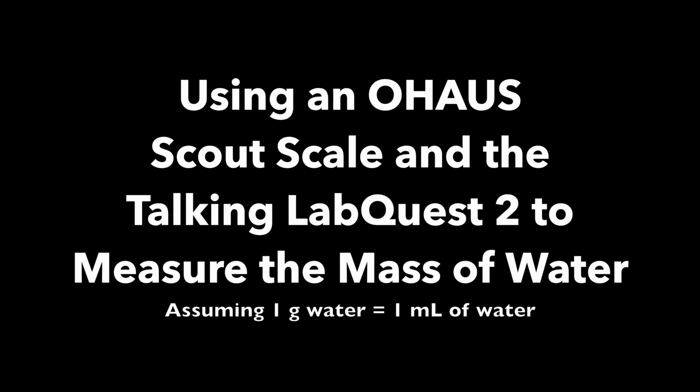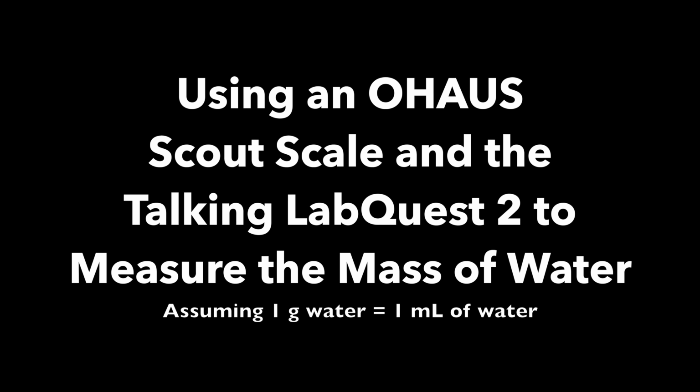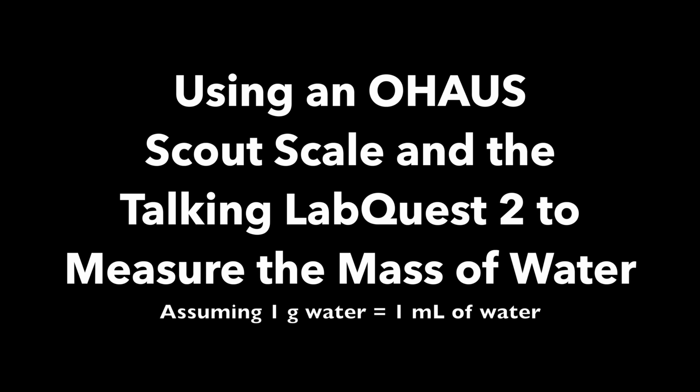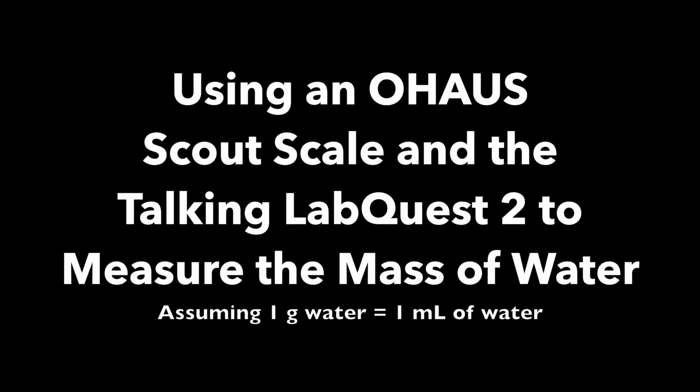Using an OHAUS Scout scale and the Talking LabQuest 2 to measure the mass of water, assuming 1 gram of water equals 1 milliliter of water. You could always use the density of water by measuring the temperature of the room if you need something more exact.